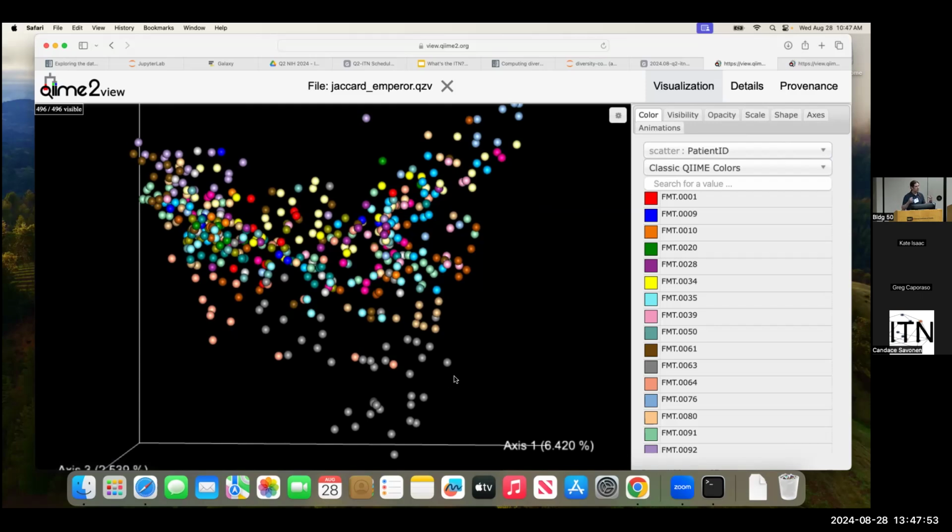They tend to group closer to each other relative to other subjects in here. And if I look at these purple samples up here, those are from one subject again, just because of how I color this. So I would look at this and say, sanity check, yeah, this looks sane.